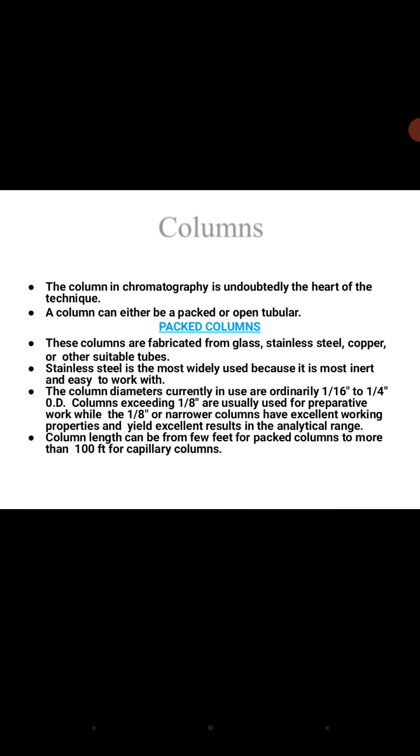Now let's talk about columns. The column in chromatography is undoubtedly the heart of the technique. A column can either be packed or tubular. Let's discuss each of them thoroughly.